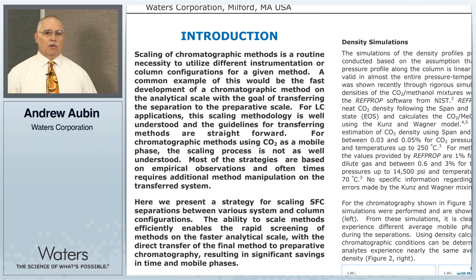In supercritical fluid chromatography, the density of the carbon dioxide mobile phase significantly influences the separation. Therefore, changes in the methodology, whether they be flow rate or particle size or other factors, can significantly change the separation. These are the factors that make scaling challenging.